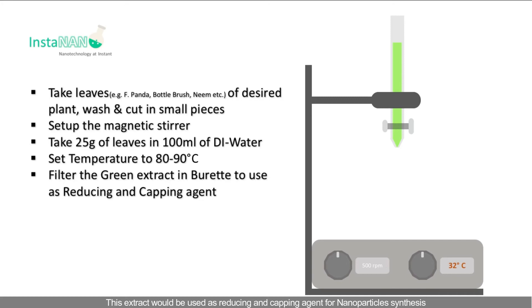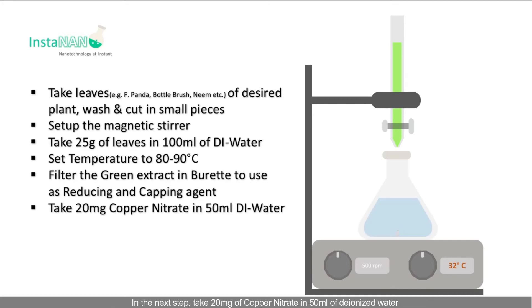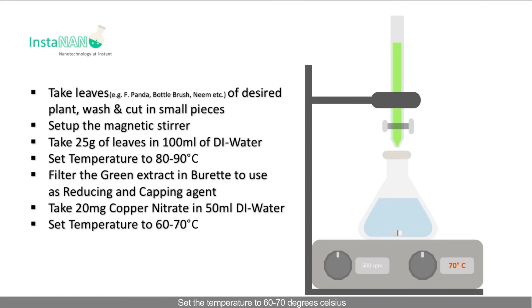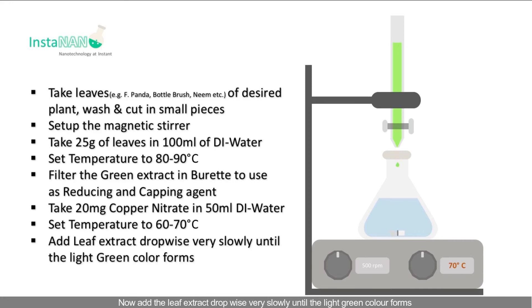In the next step, take 20 mg of copper nitrate in 50 ml of deionized water. Set the temperature to 60 to 70 degrees Celsius. Now add the leaf extract dropwise, very slowly.